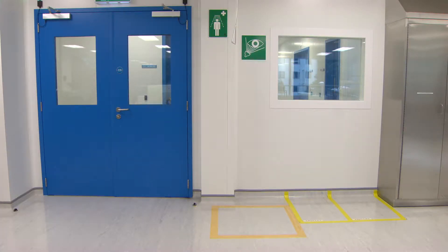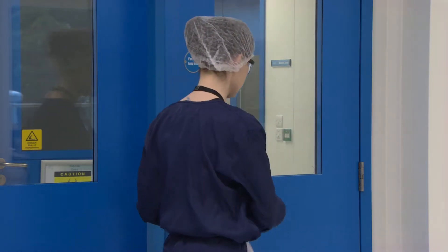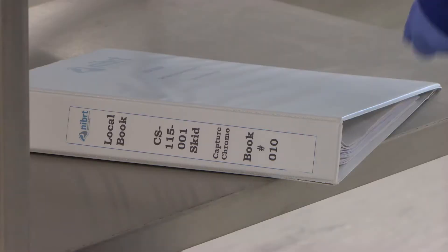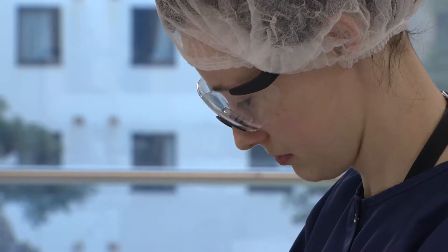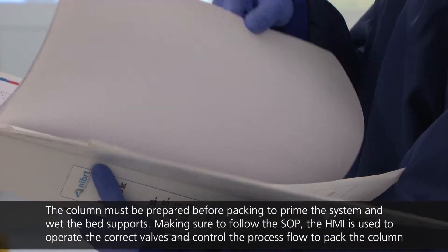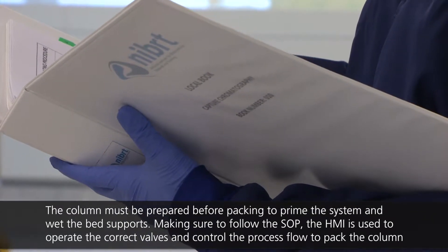The chromatography column must be prepared according to a standard operating procedure to ensure that all processes are carried out consistently batch to batch. All sanitized items required for operation are checked against the SOP record book. The operator confirms that all items are present, in suitable condition and sanitized prior to undertaking the protocol.